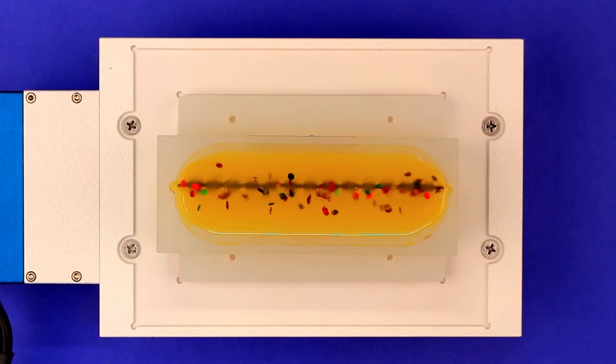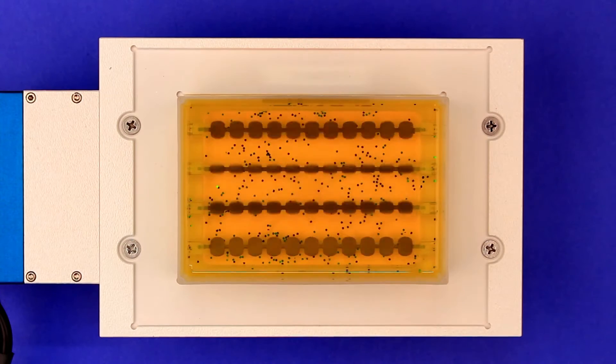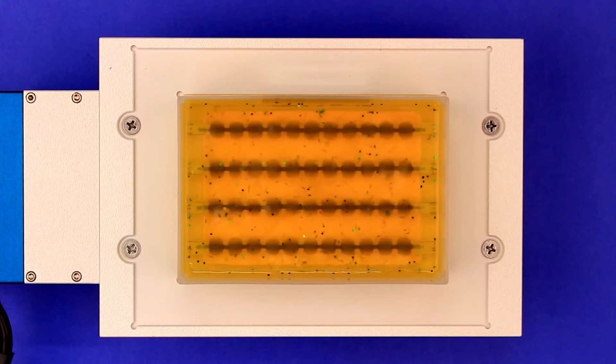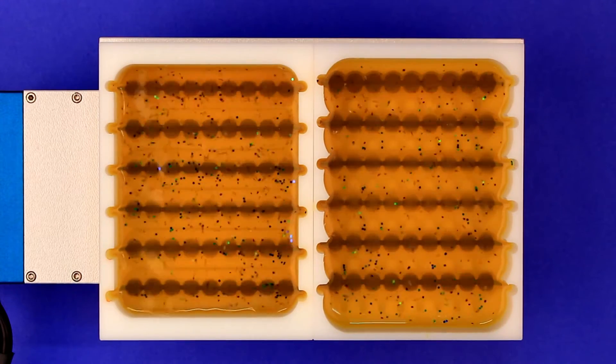Using our bubble paddles, reservoirs are great for keeping particulates such as cells or beads in suspension. We use glitter to simulate particulates in the reservoir. While your solution is being mixed, you can access your sample with your pipetter.